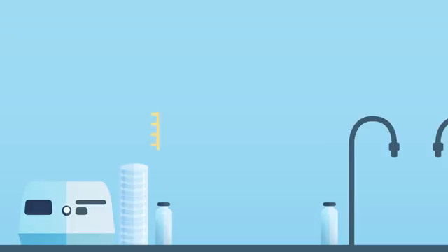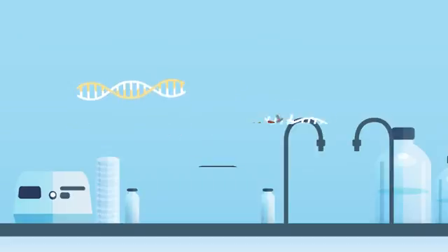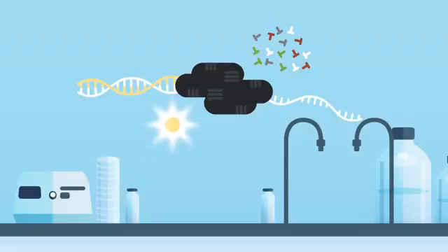The amplification is detected by measuring a change in a fluorescent reporter signal. So, one of the critical components in real-time PCR is this fluorescent reporter. The reporter is a part of the reaction mix, and there are two general types of reporters that are used.